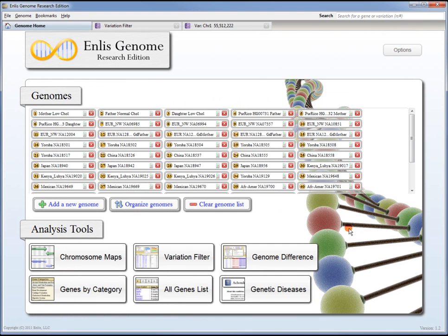We've just shown a few of the tools that we have in the software. We have some other videos on our website if you'd like to take a look at some of the other functionality of the program. We also have a trial version, so you can sign up for a free trial, give it a try, and let us know how we can help you with your research.